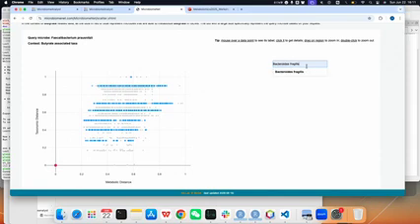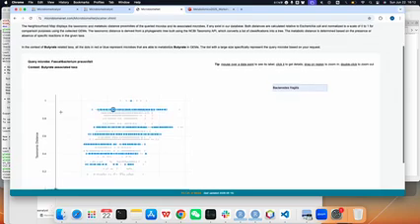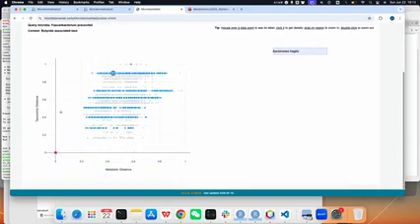We find a statistical correlation with this species. We can see it highlighted here, with a relatively moderate metabolite distance, but they have a quite different taxonomy distance. And this is all the data points highlighted here.